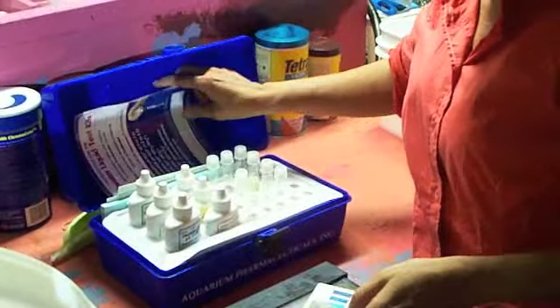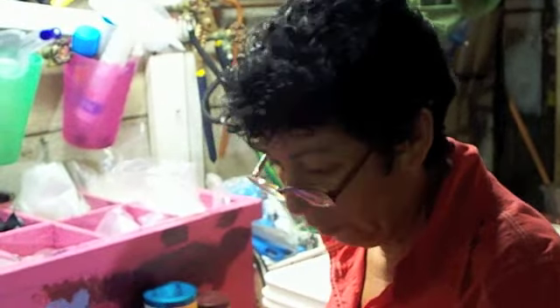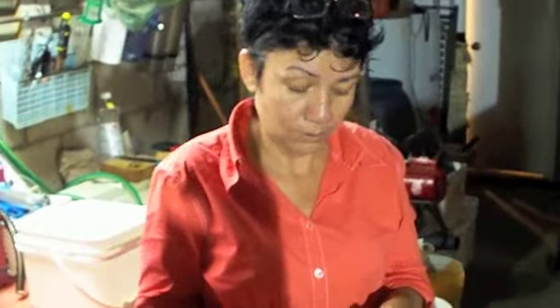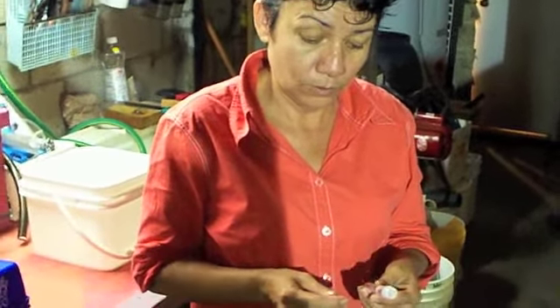I have to take water from there? Yeah. How are you going to take water from there? Well, I just dump this one. No. Why would you not want to put that vial in the water? Oh, because it's contaminated? Yeah, it's got test kit stuff in it from another test. It's been rinsed, but it's a paranoia thing. You never ever put a test vial into water, because on that one day that you forgot to rinse it out and you put it in and dump in, say, Nessler's reagent, everybody dies. Oh, really? Then I have to rinse it. Well, it's already been rinsed. Then you don't have to rinse it. But for the truly paranoid, you always assume the worst.